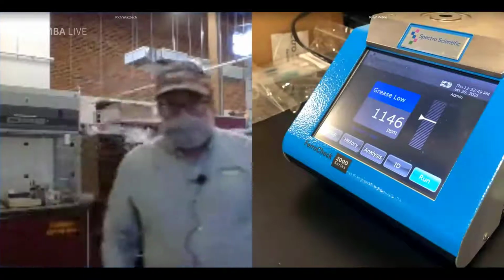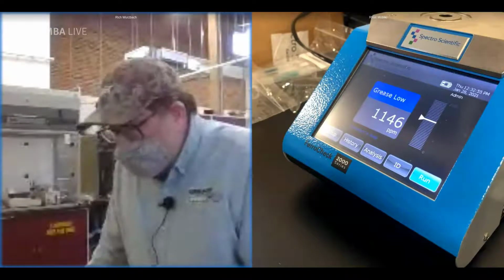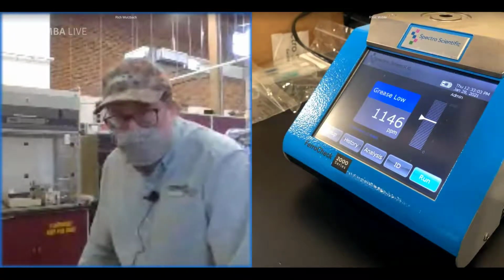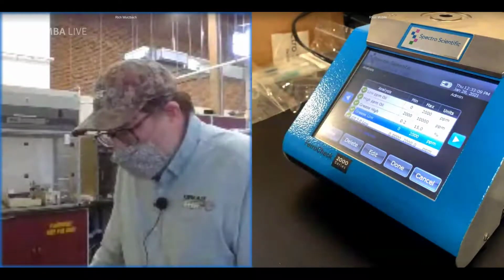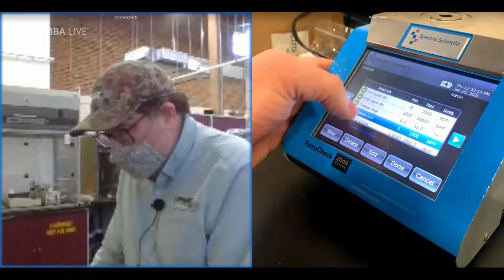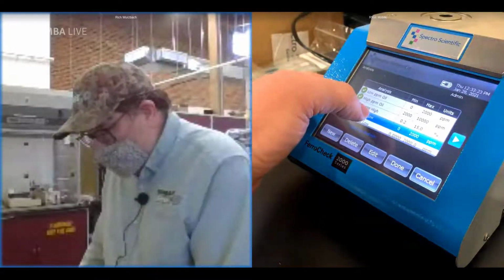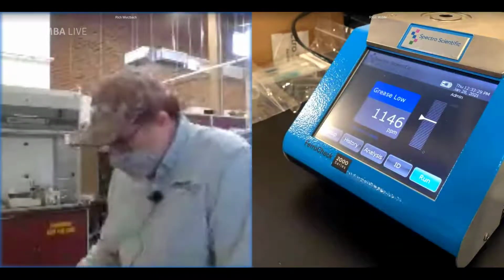All right. So the first device we have here is the FerroCheck from Spectro. This is an instrument that's been out there for a few years. It's being used for oils, but it also has grease capabilities as well. You can use this by choosing the type of application you have, whether it's oil or grease, whether it's a high concentration, low concentration, or what you expect it to be. And it's got some different ranges for that. So we can start here with the grease low setting and select that. And then we can make a measurement.